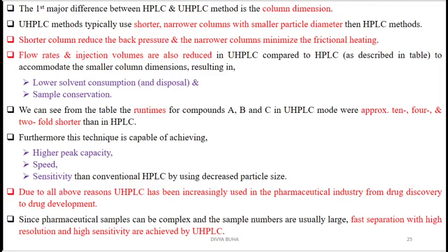Okay, you should understand what back pressure is, because over here we know that the instrument is being operated under high pressure, and the columns which are mostly used would be completely packed columns, and the particle size of the stationary phase is also very small. It would be in micrometers, right?